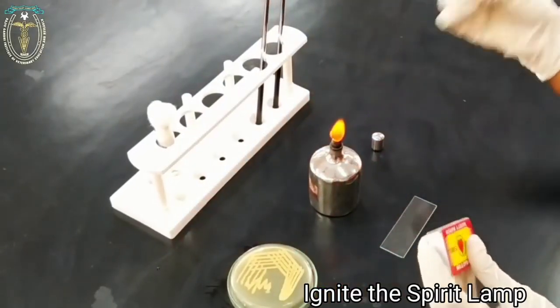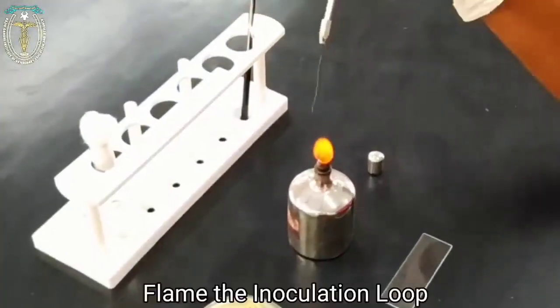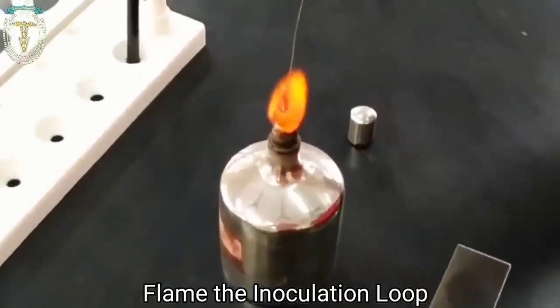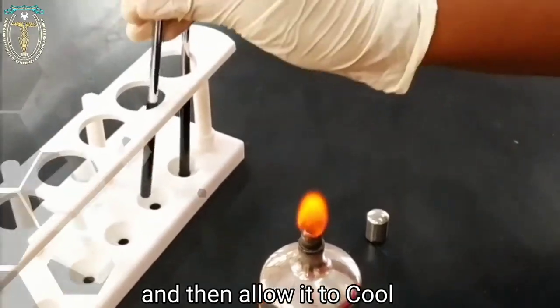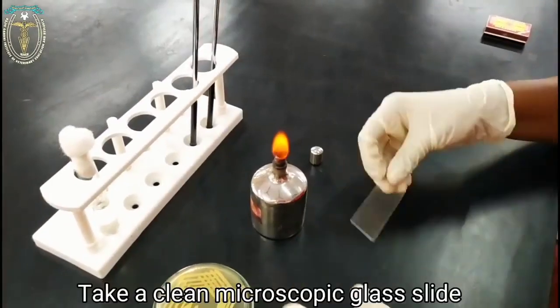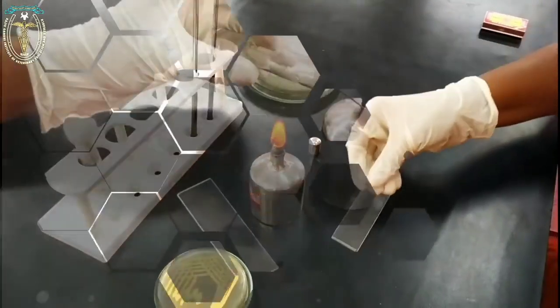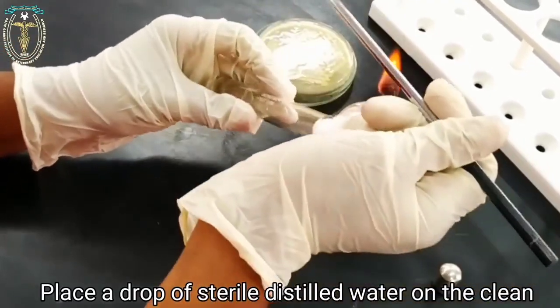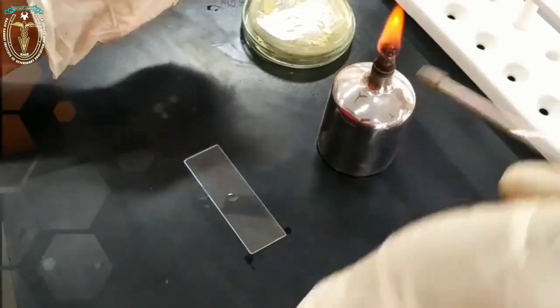First, ignite the spirit lamp. Flame the inoculation loop to red heat. And then, allow it to cool. Take a clean, microscopic glass slide. Place a drop of sterile distilled water on the clean glass slide with the help of the inoculation loop.